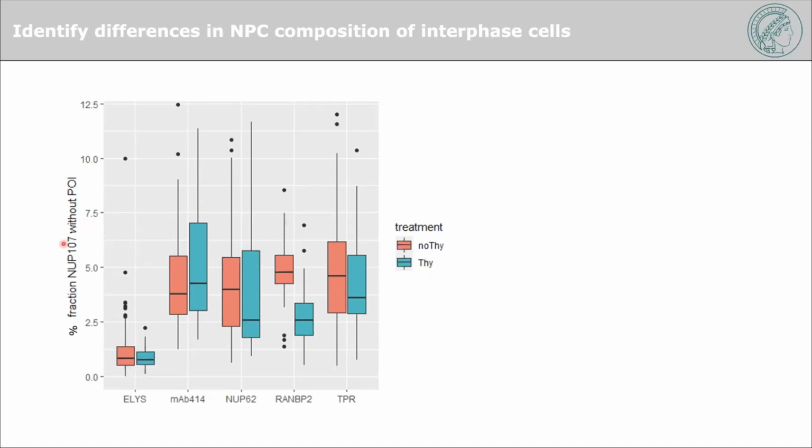And we are looking at small percentage changes, so 2 to 3% changes, which are really hard to pick up with small numbers of cells. So that was interesting to show that using this automated super resolution method, we can achieve enough numbers to come over the noise that is intrinsic to our data and get some biological results out of it.